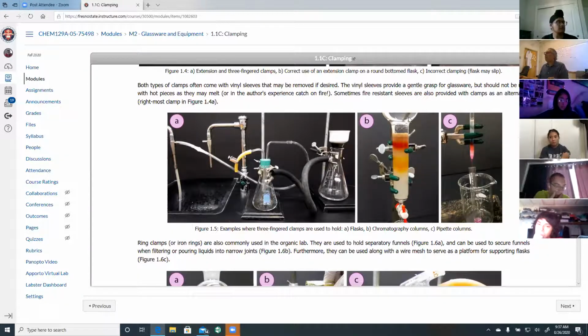So as you pass a mixture of compounds, a red compound and a yellow compound, which used to be a mixture, through this pack of silica gel using a solvent, they interact differently. Each component interacts differently with the solvent and the silica gel, and they separate.